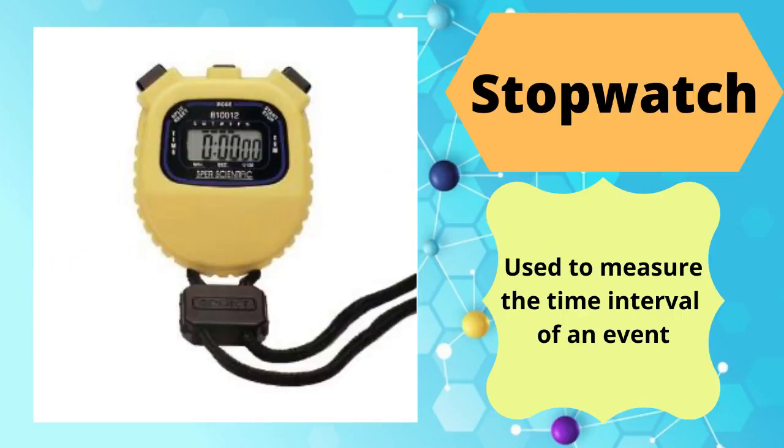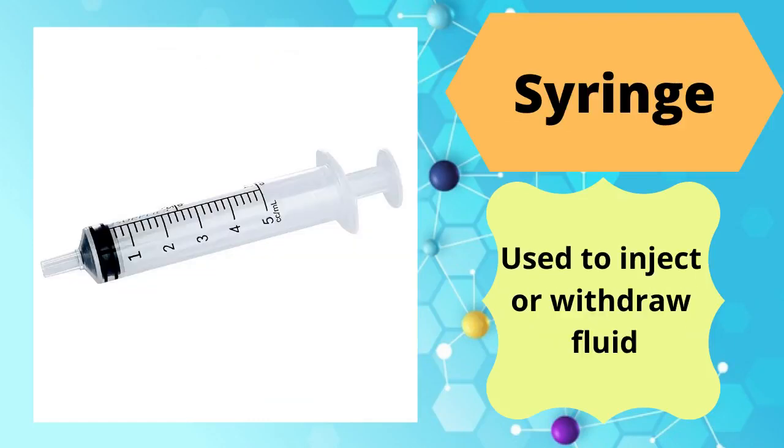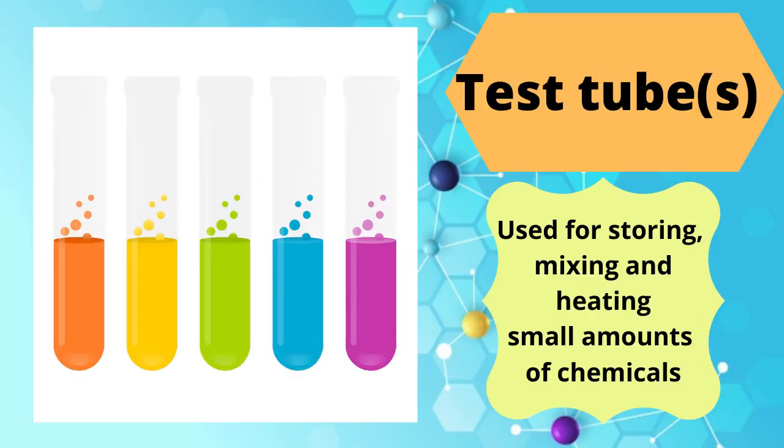Stopwatch, used to measure the time interval of an event. Striker, used to light a gas burner. Syringe, used to inject or withdraw fluid. Test tube, used for storing, mixing, and heating small amounts of chemicals.